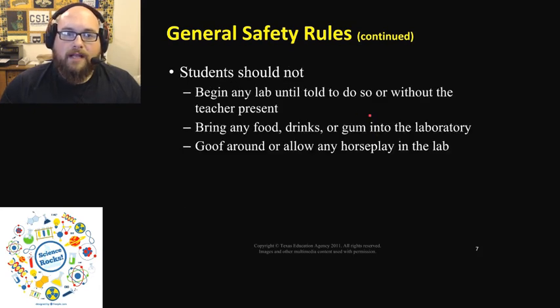One of the last things: do not begin the lab until you are told to do so. You cannot work on anything without the teacher being present. That is super, super important. Do not bring any food, drinks, or gum. I'm going to reiterate that. That's very, very important. If you do, let me know, and we will put it in a safe place so that nothing bad can happen to it.